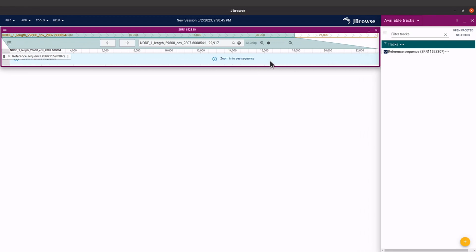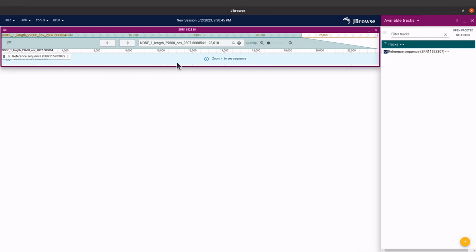But we are not done — we only loaded the FNA file. We need to also add annotations. We've only loaded the sequence; we need to add the features. So on this same window, come to the bottom, the lower part, and you will see this plus button here, so click it.